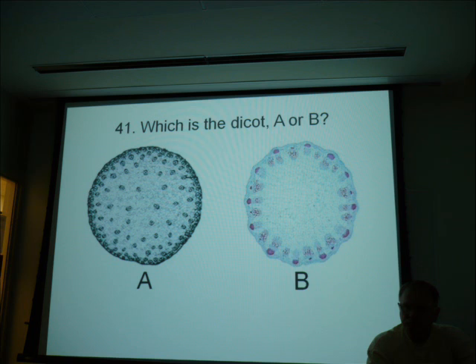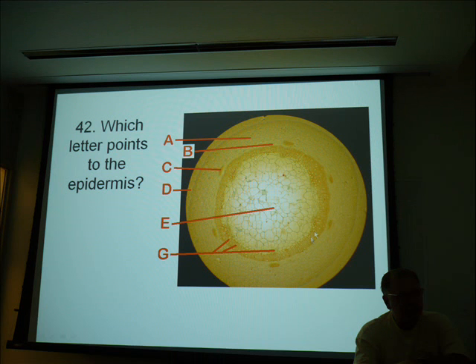And you see the ring. Sometimes the ring's inside here, like ours was. Sometimes outside there, so you just look for the ring. I don't care what the ring is. And you look for that ring and you got dicot. I see ours was inside.